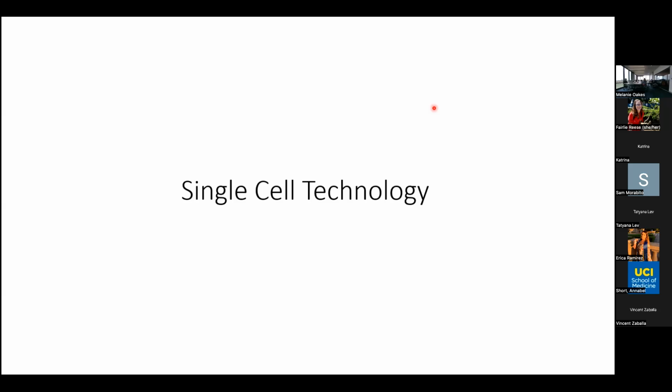So we can play with it, but we would need the GridION or the PromethION. They're weird with their closed source stuff. They are. You need to join their cult. You do, I swear to God.